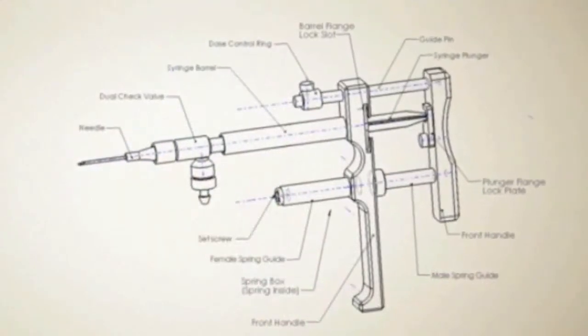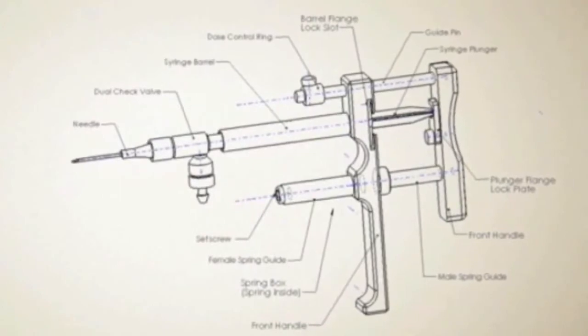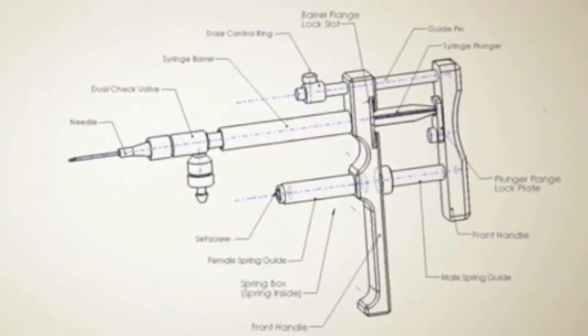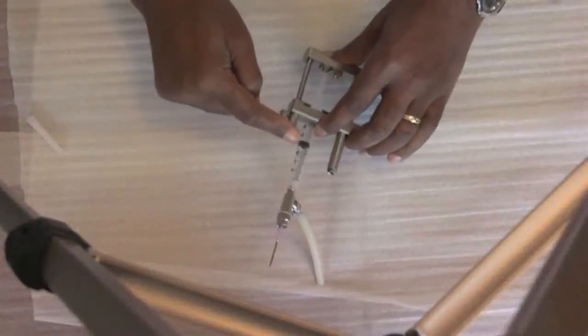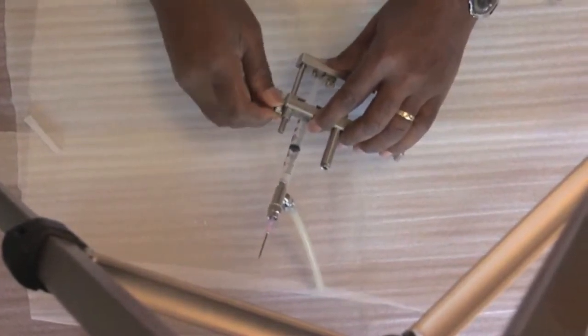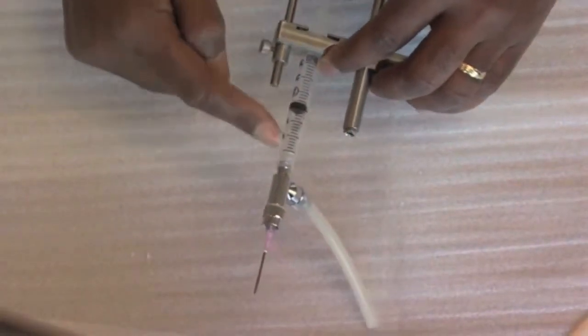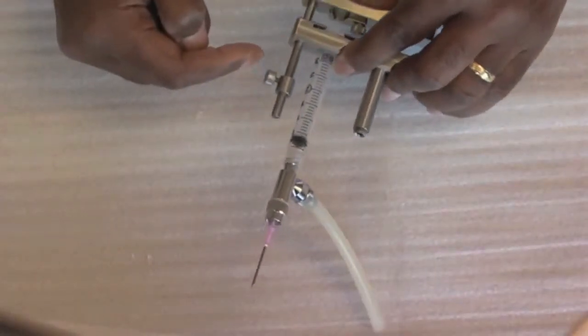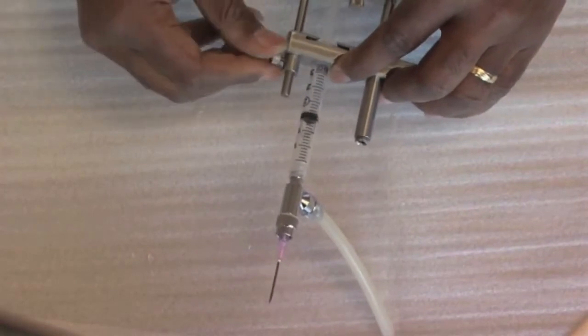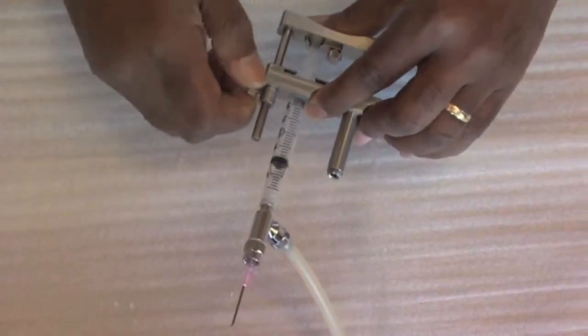We will now demonstrate how to control the dosage volume delivered with each compression. First, loosen the dose control ring, then adjust the volume to the desired level and tighten the dose control ring.